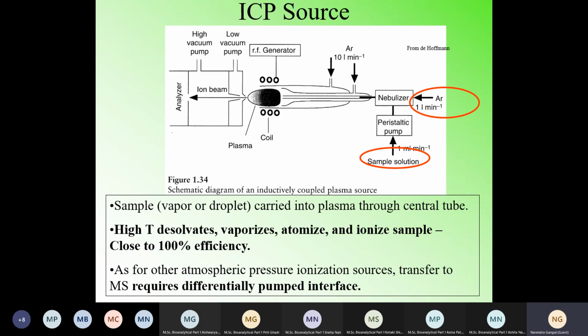ICP-MS is a very costly technique, because of the mass spectrometer involved, and ICP is a source that can anyway be used along with optical emission also. So it's not a technique for simple inorganic species which are in a larger quantity. It is only to be used for very specific things that I want to determine at very low content. I can't just afford to use it for simple materials. It has to be used only for special cases where normal techniques fail.